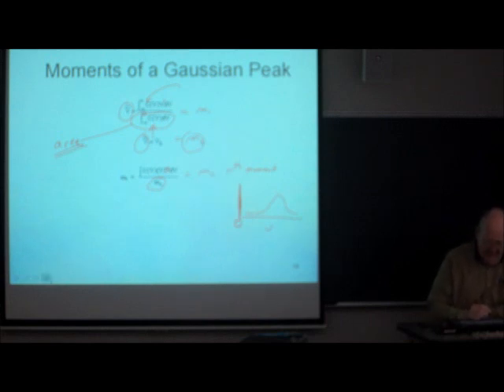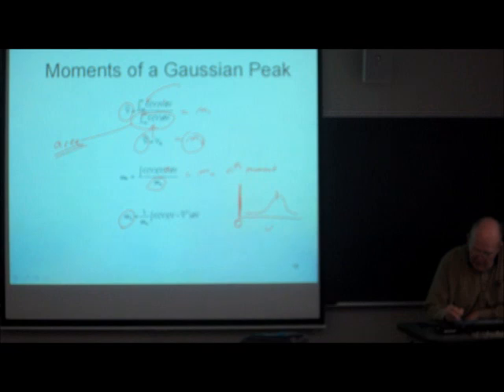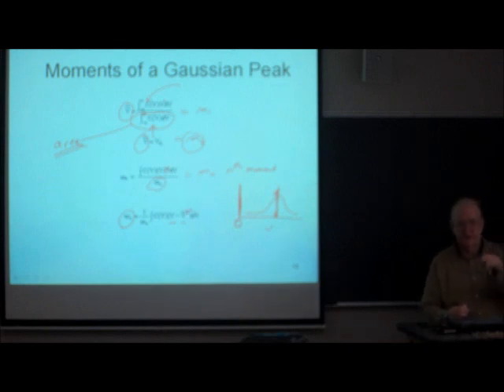And it's frequently the case that for the higher moments, like the second moment, we compute the center of gravity, and then we compute the moment about the center of gravity. I just really did a bad job of getting that through the center of gravity. There's the center of gravity. Remind me to fix that. That equation is wrong.